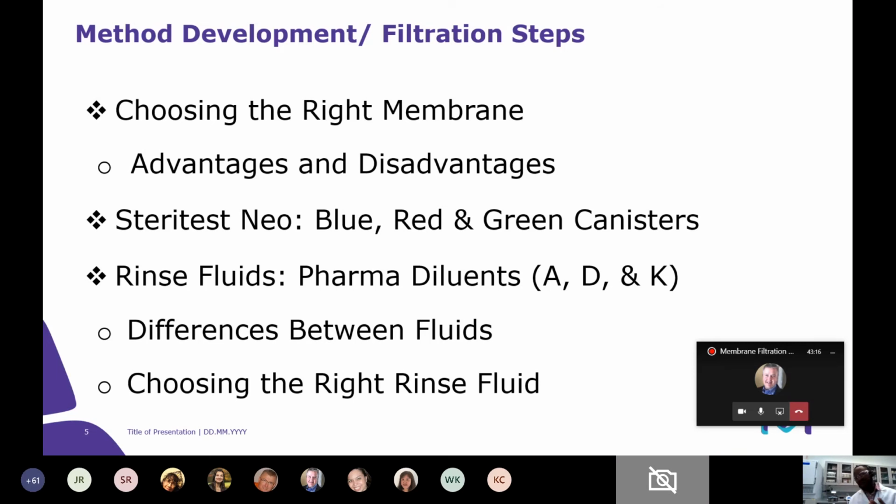Then you filter it slowly, at a speed of 40 mostly. Why slowly? Because you want to give it enough time to engage your membrane. After that, in my experience, you can go straight to your product, but I like to put another 50 mL of the diluent. That way, when I start filtering the product, it's not directly on the filter. The product comes in a little diluted.